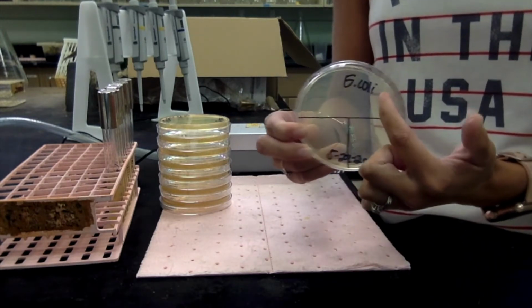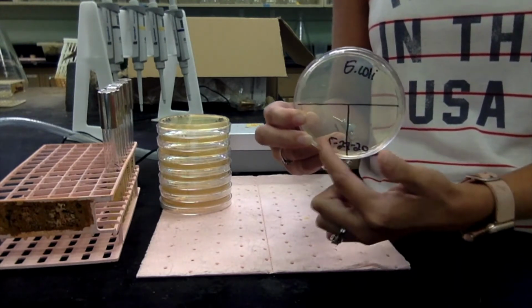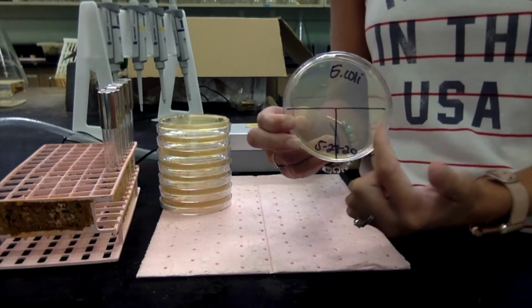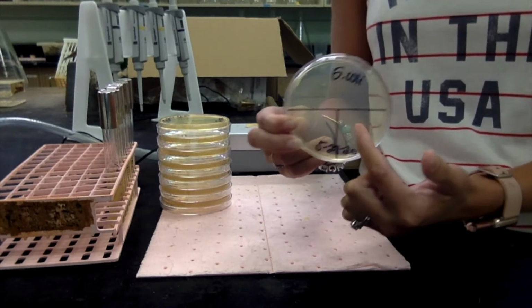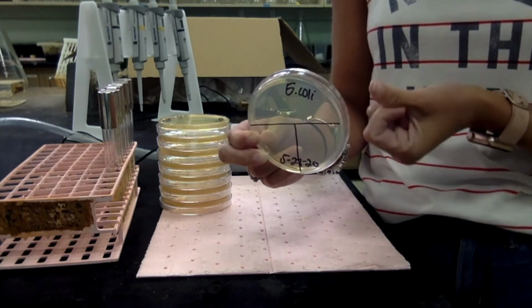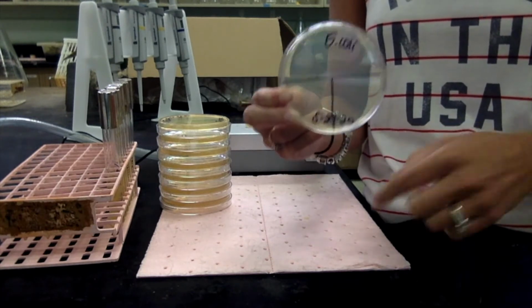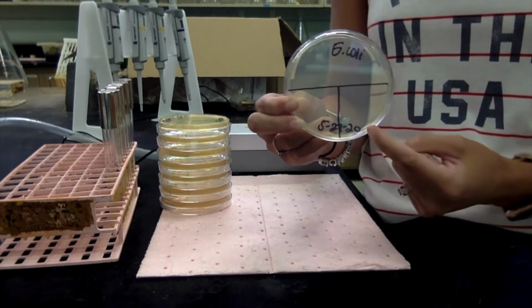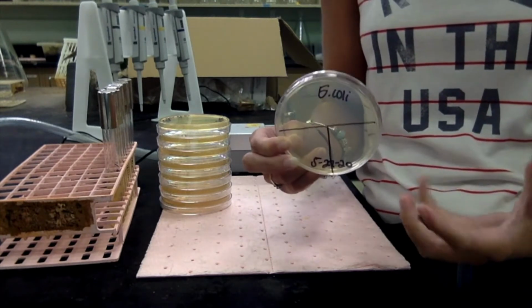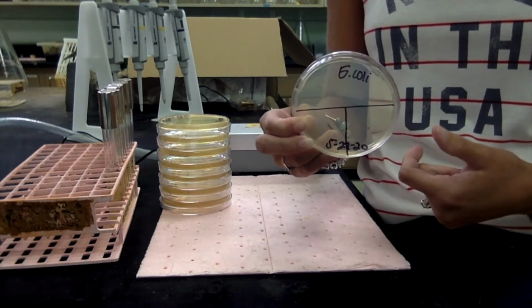We're going to put lots of cells on the plate here, then we're going to dilute them down, to where hopefully over here in the third quadrant, we only have a few cells, and then those will give rise to our isolated colonies, where it's one colony by itself. Then we use that colony to do stains and any other tests with, because that colony came from the same bacteria. So we know that it's all the same strain. And so that's what we're going to do with the streak plate.